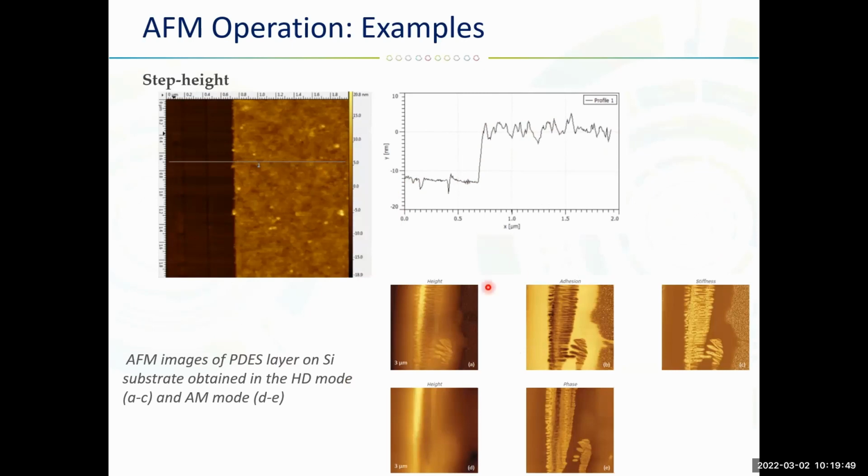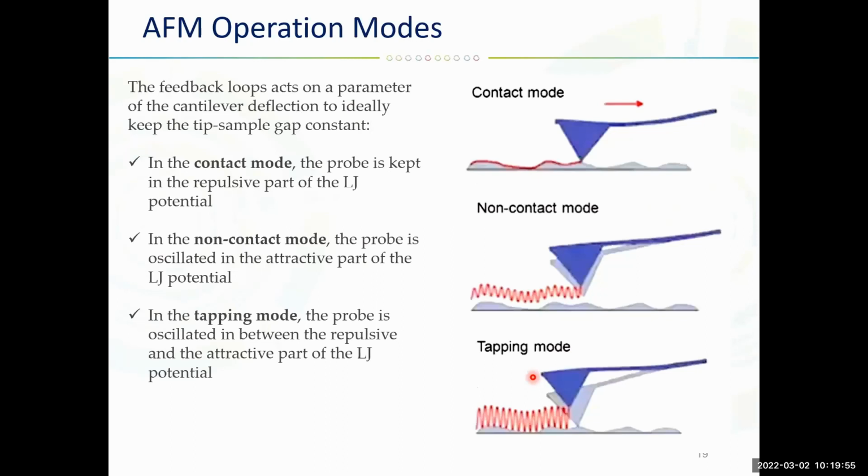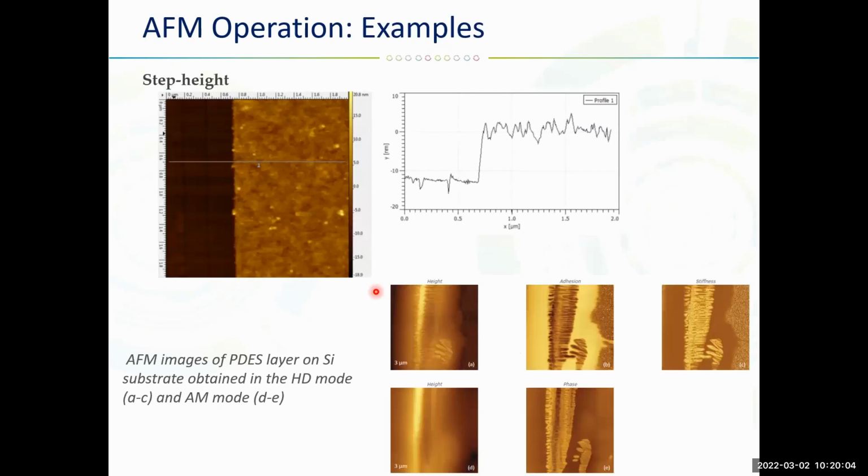And here I want to talk about the hybrid mode. Before that, we were talking about contact mode and oscillation modes with some sort of resonance, right? But hybrid mode is an oscillatory non-resonant mode where the probe and the sample are brought into intermittent contact in the vertical direction, and the probe deflection is also induced, and we use it for tracking feedback. The basic idea is to minimize the lateral force and interactions between the probe and the sample.